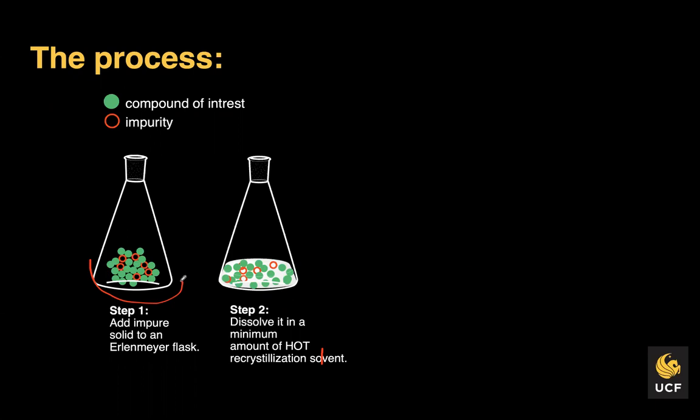If it's soluble, then that wouldn't make it a suitable recrystallization solvent, because you want it to be insoluble at room temperature. If you heat it up and it's soluble, perfect. Then you would cool it down slowly and see whether it remains soluble or not. But remember, it is temperature dependent when you pick your recrystallization solvent.